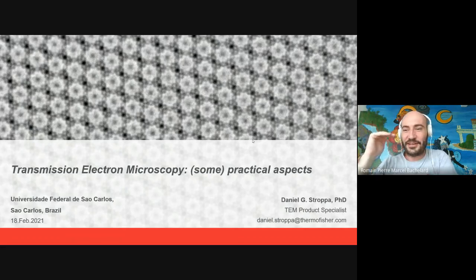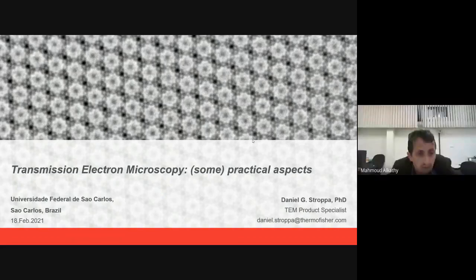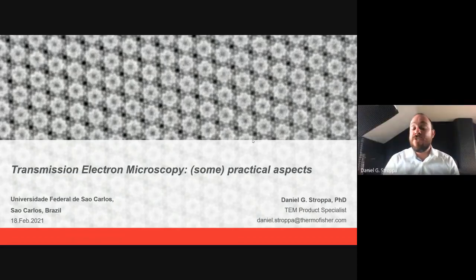So I have a very basic question. In this last slide that you've shown, the chemical mapping, you said that you can acquire images really quickly. So can you do real-time videos, for instance, of chemical reactions? Can you see how hard would it be, or is it not possible to see that? So chemical reactions, they are very fast. They are outside the time range.